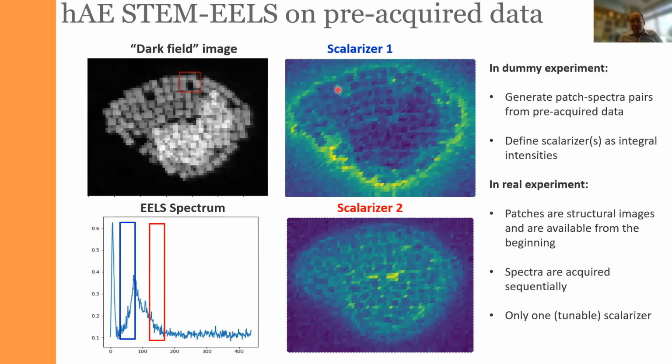Usually when you deploy the code on the microscope, the code should already work, and it should already be more or less optimized. Also, an important thing is that the microscope never remains stationary. Your beam tuning starts to drift, your sample accumulates damage. If you do scanning probe microscopy, then your probe can be damaged.